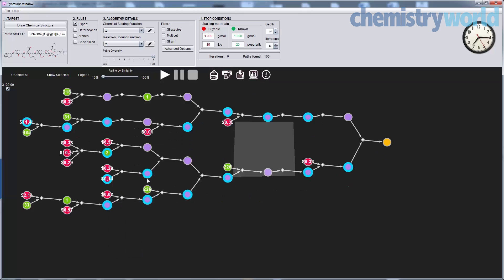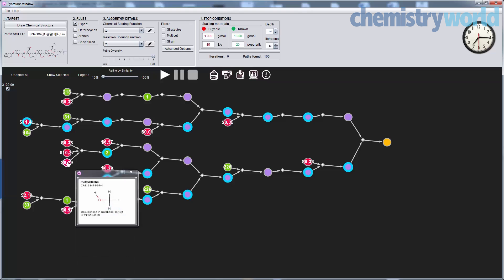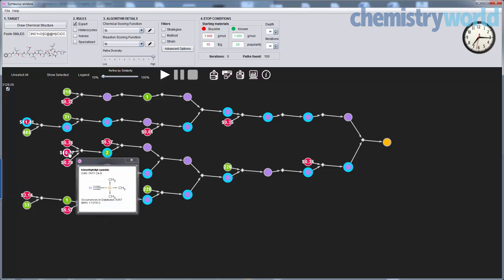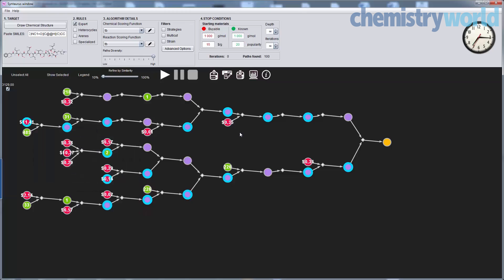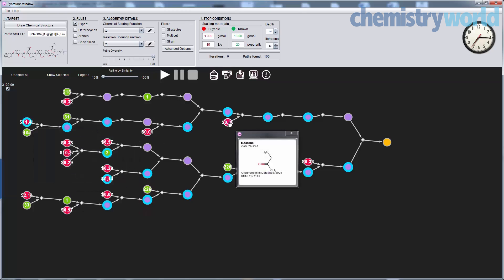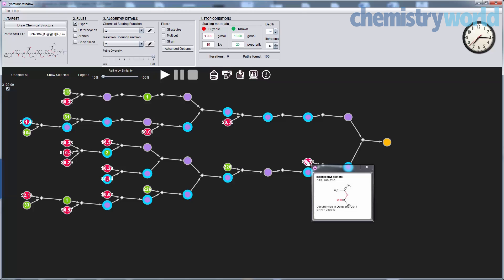We can also display the prices and the popularities of the red nodes — the starting points, the buyable materials — and the green ones. The green ones are known somewhere in the literature, and the numbers over them signify how many reactions they were used in before.